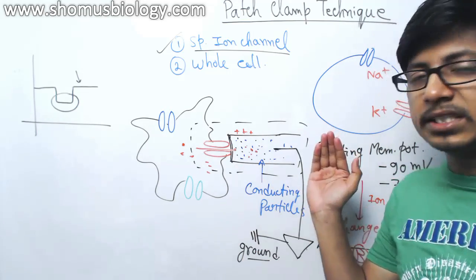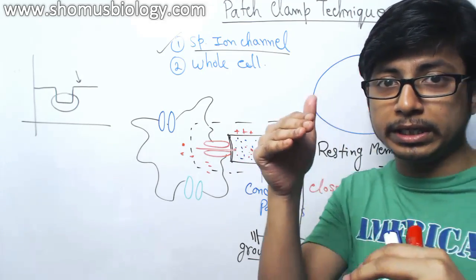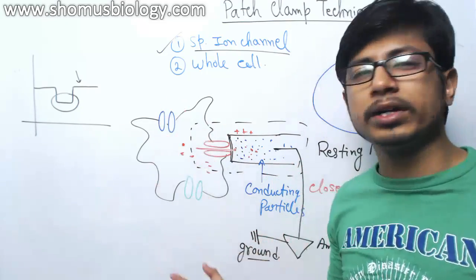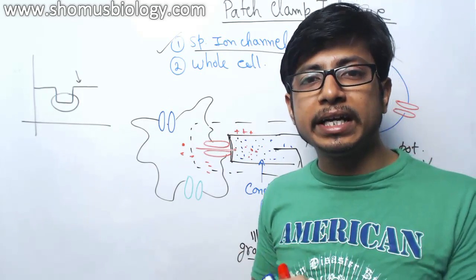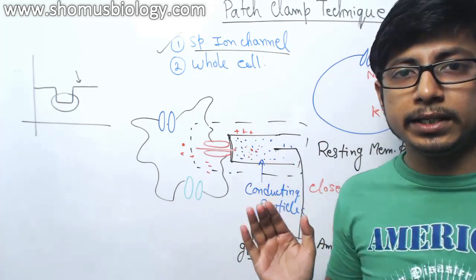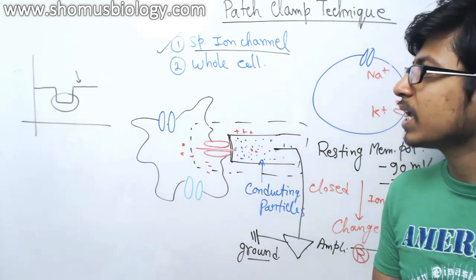Normally we have a trained system: a dispenser, or pipette dispenser, that helps the pipette to move accordingly. It's not a human hand, because a small fraction of vibration can destroy this whole experiment. And another thing, while the experiment is being performed, we use a non-vibrating table and a non-vibrating table microscope, so that everything is without any vibration. If there is a little vibration, the whole experiment will be ruined.